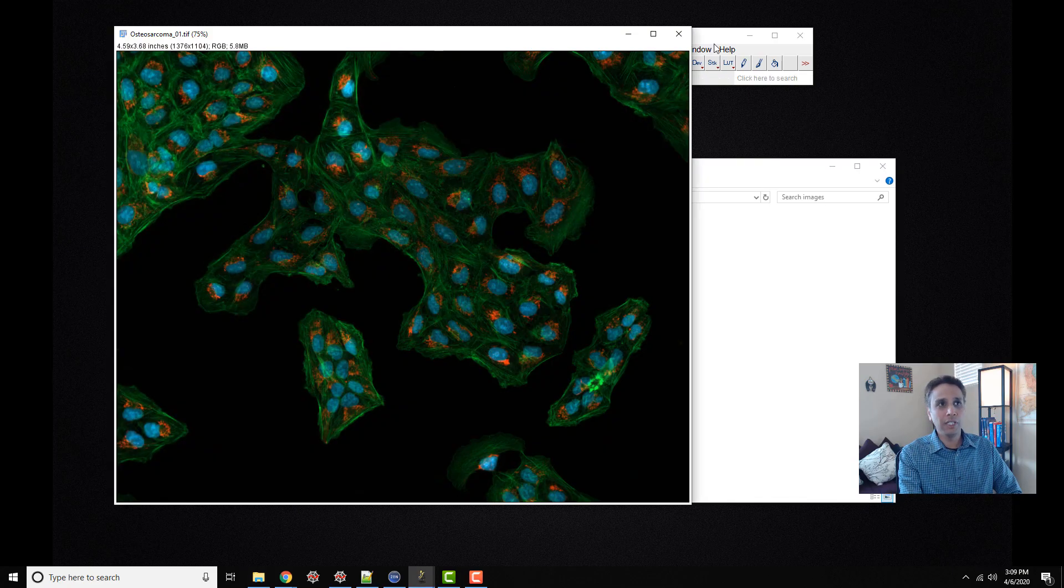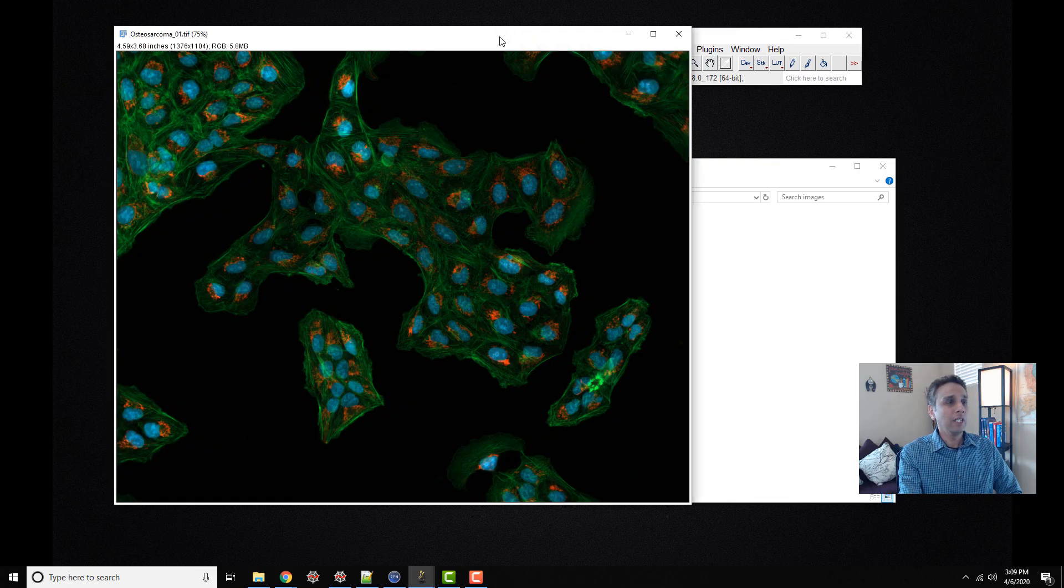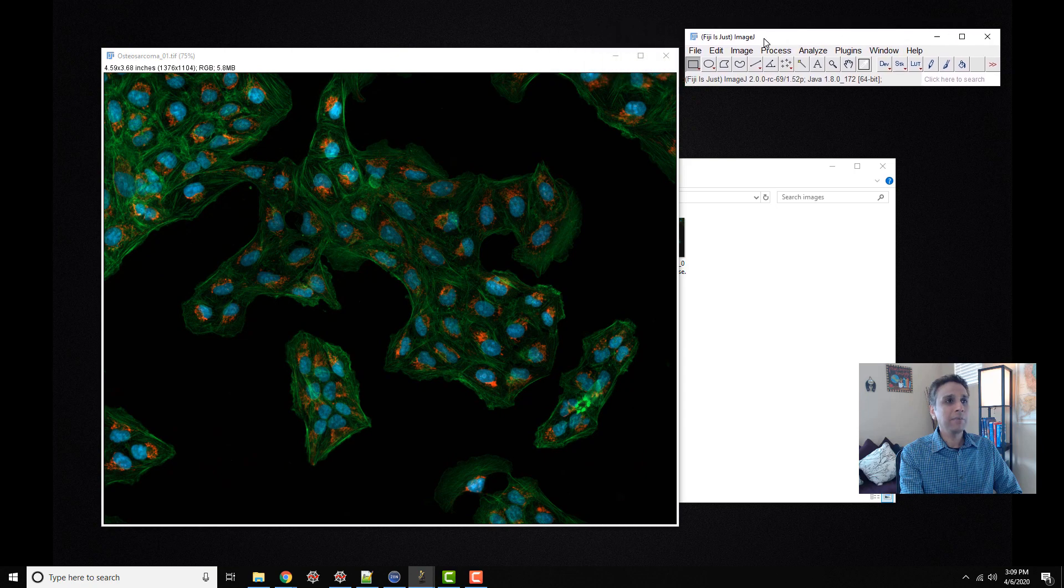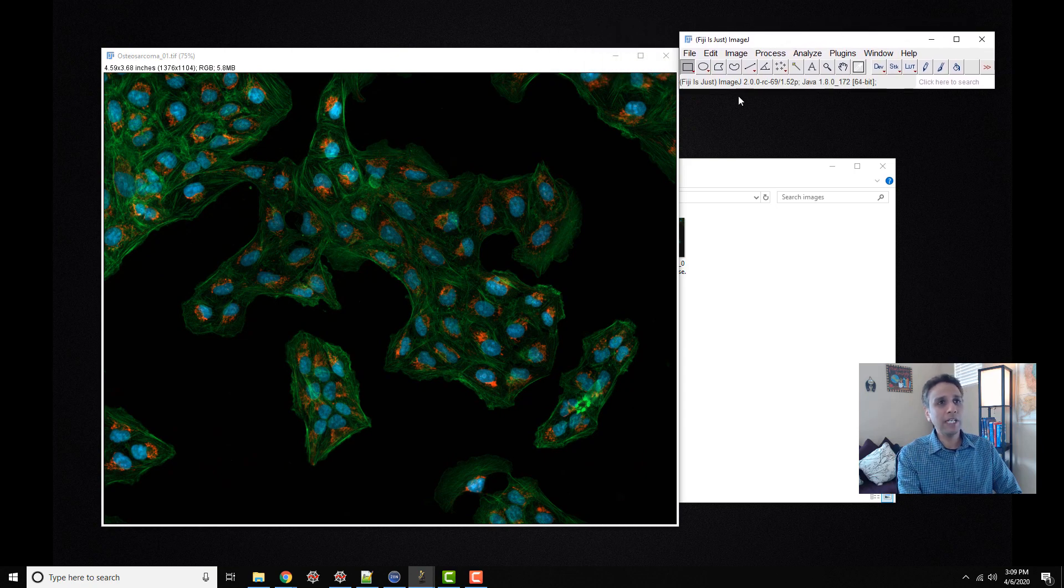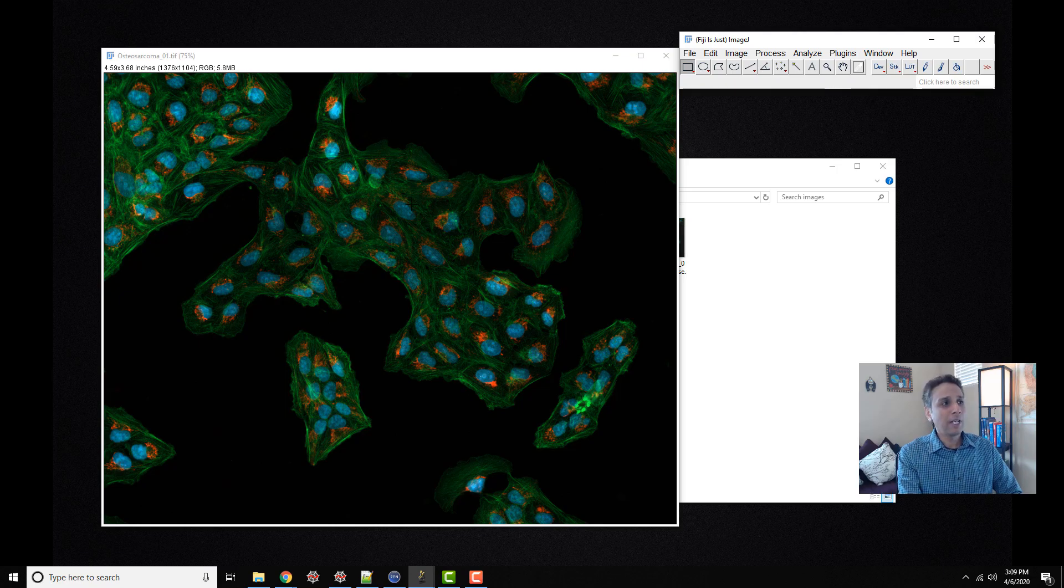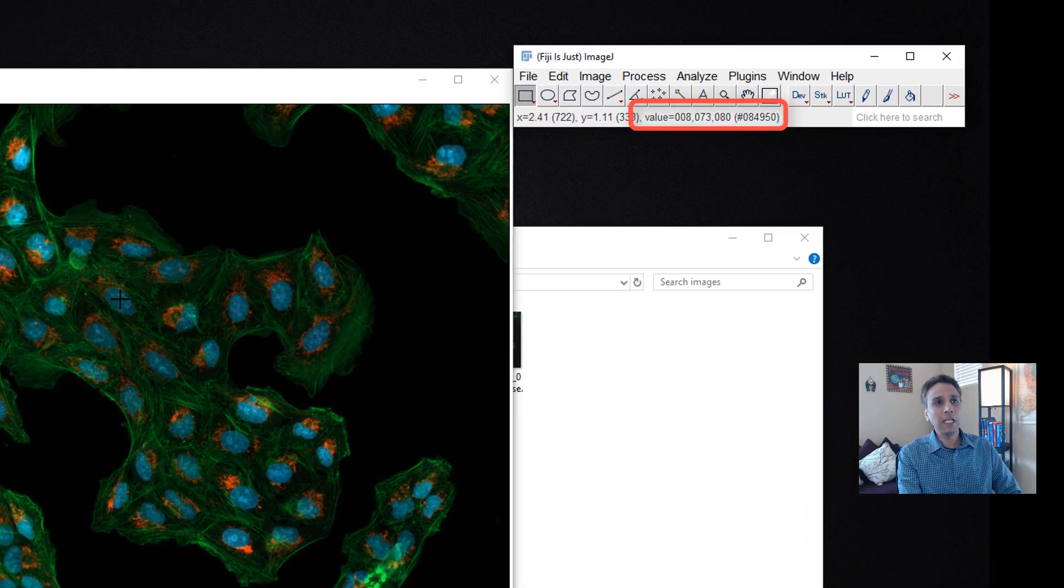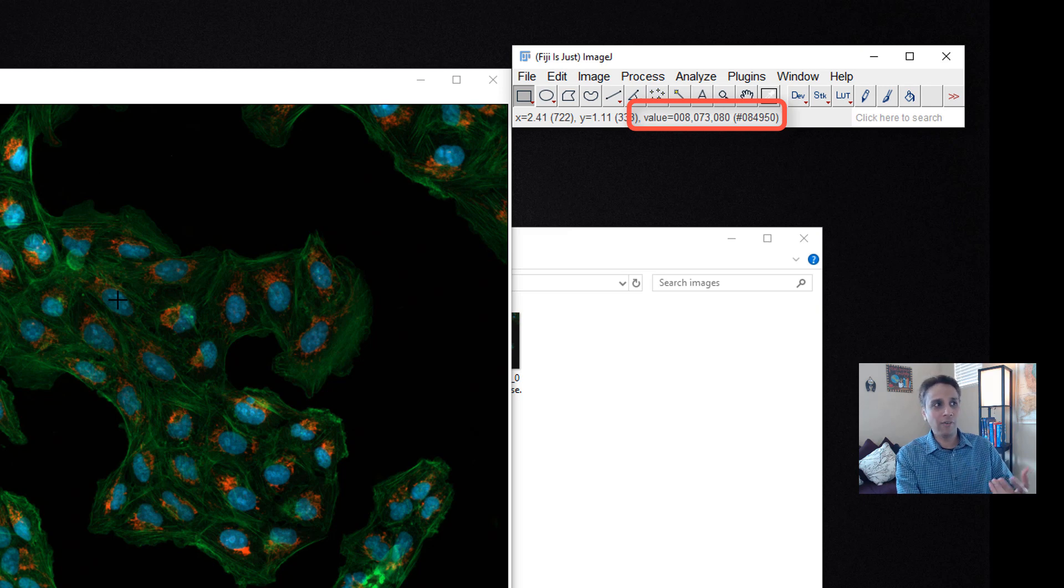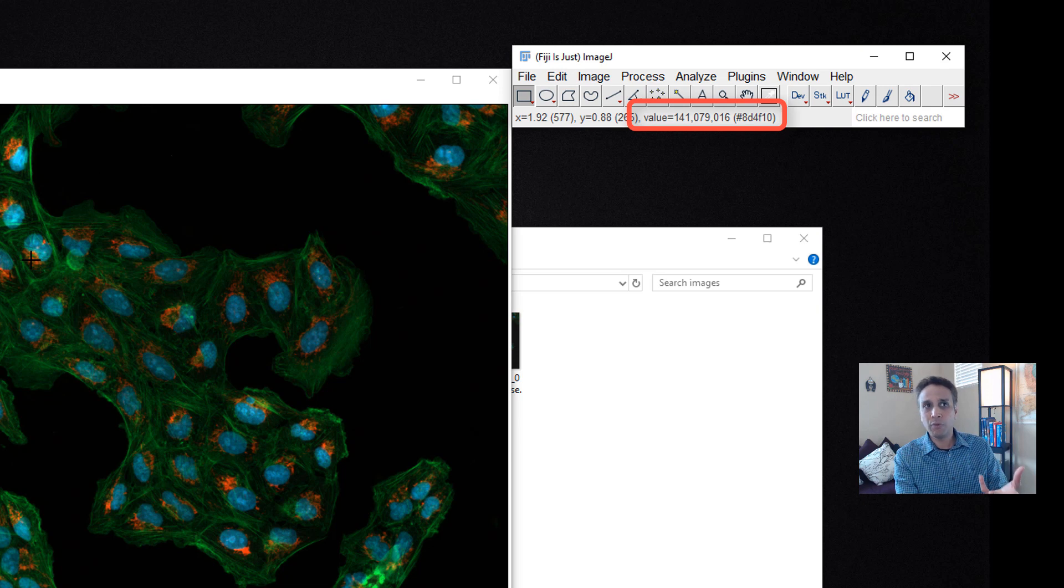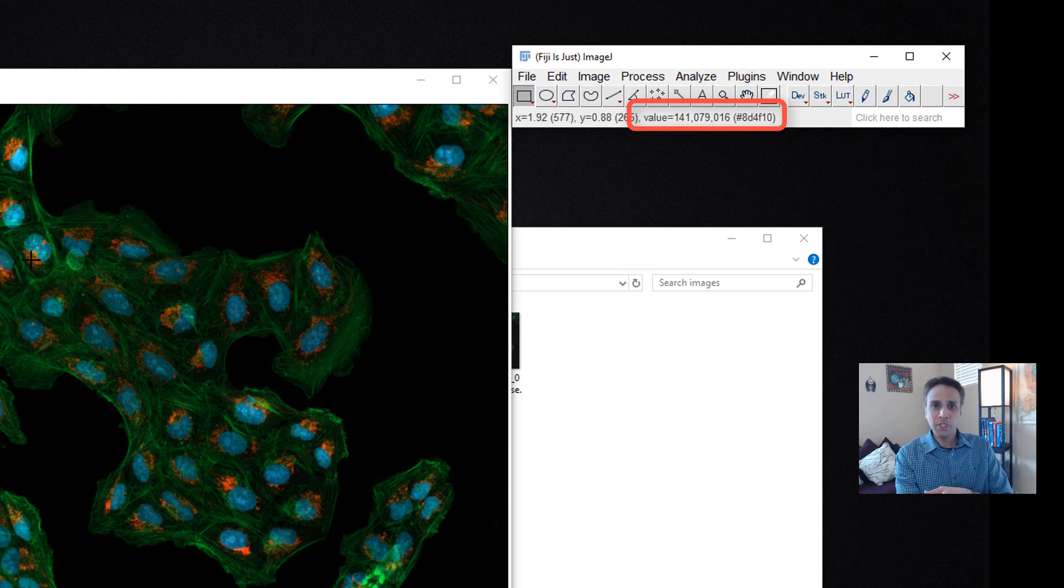I just dragged it onto the ImageJ UI. I want you to read the numbers up here, wherever my mouse is. When I move the mouse, it says the blue value is 80, green is 73, and red is 8. That means it's more blue and green than red. If I move my cursor to the reddish area, you can see now I have more red, 141, a little bit of green, and not much blue.